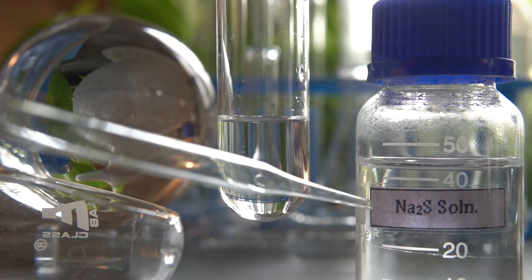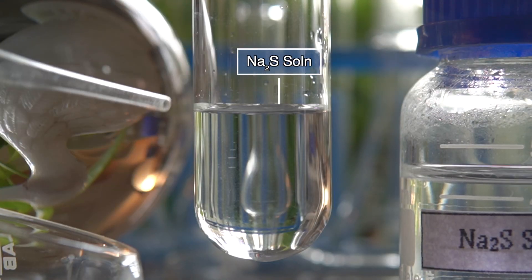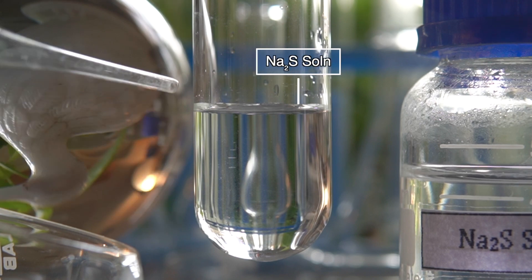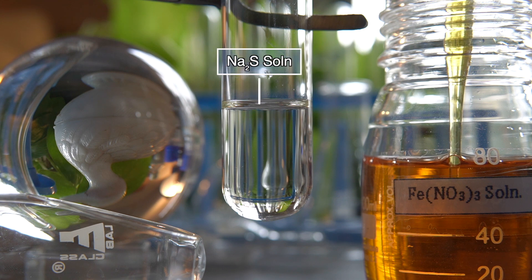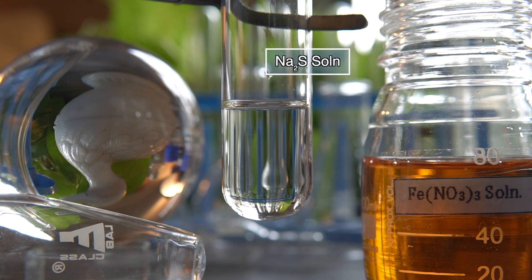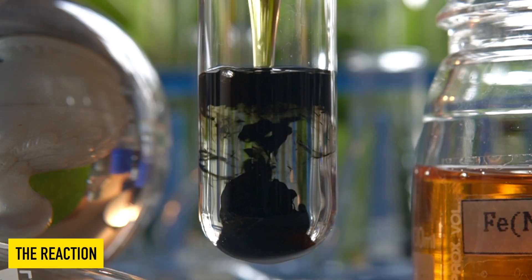Now to initiate the chemical reaction, we will take some amount of clear solution of sodium sulfide into this test tube. Now we will add iron 3 nitrate solution slowly into the sodium sulfide solution and observe the effect.